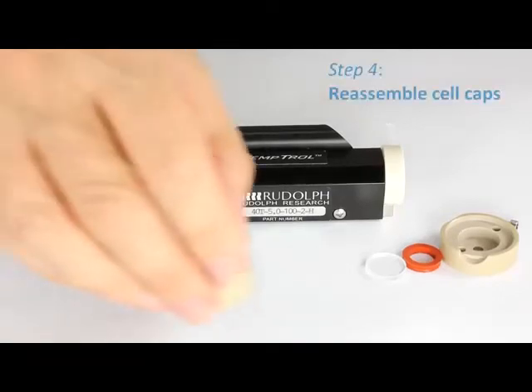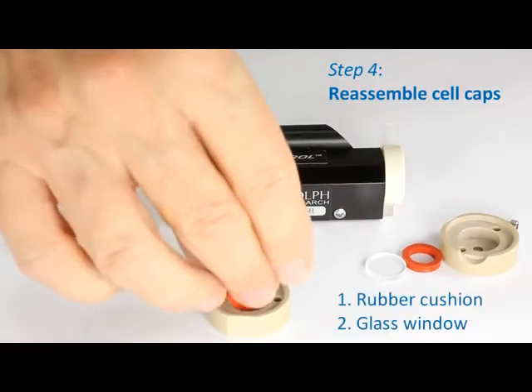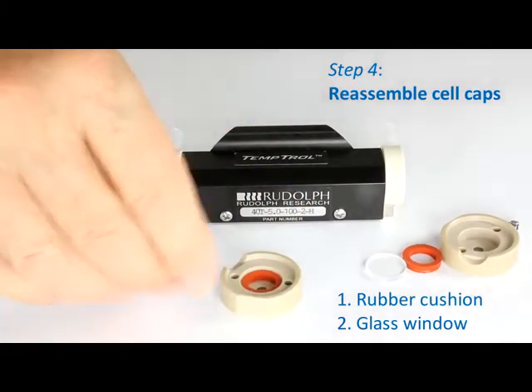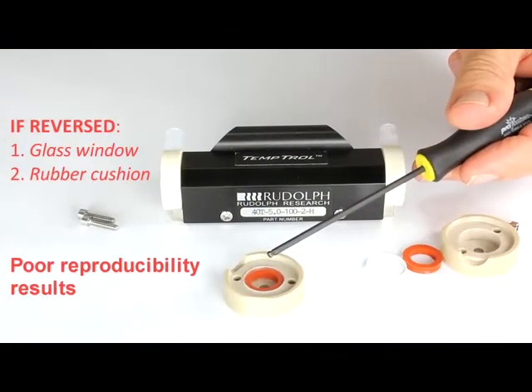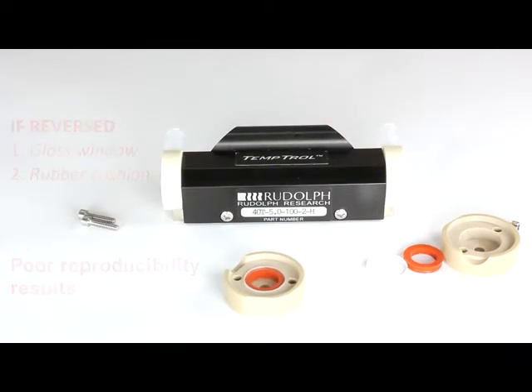When reassembling the cell, the key is to put things back in the same order they came out. In particular, the cushion must be placed into the end first, and then the glass window placed above the cushion. If this is reversed — if the glass window is placed first and then the cushion — there will be poor reproducibility, as the pressure on the end of the cell will change the cell length.